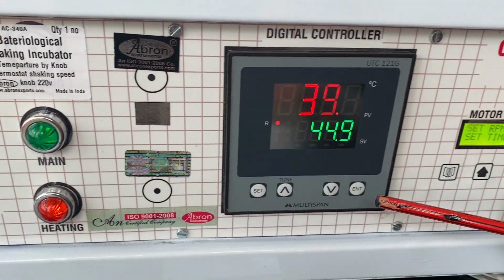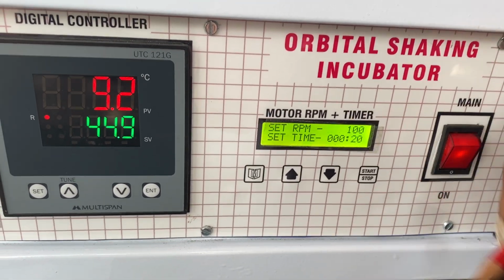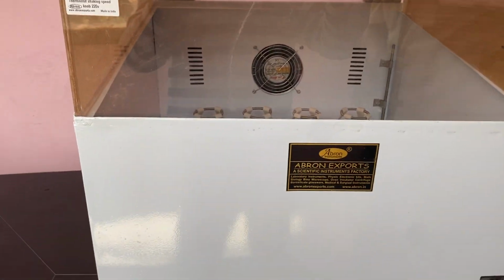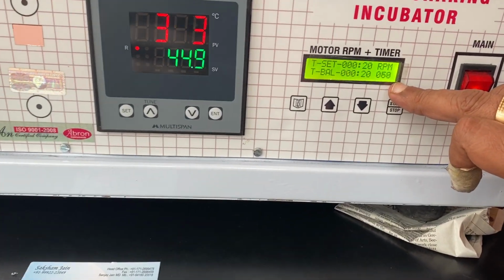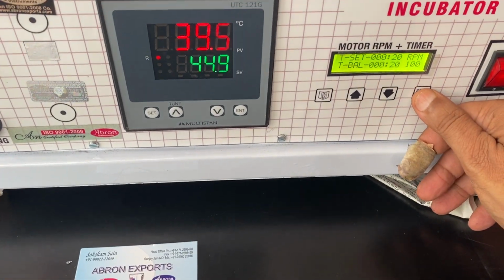This is the digital temperature controller. This is the RPM meter. The top one is RPM, and below is the timer. I will try to show you how to set it in another video. Just switch this on and press the start button. Now this timer is showing the seconds. Shaking is going on inside. And if you want to stop it, just stop it.